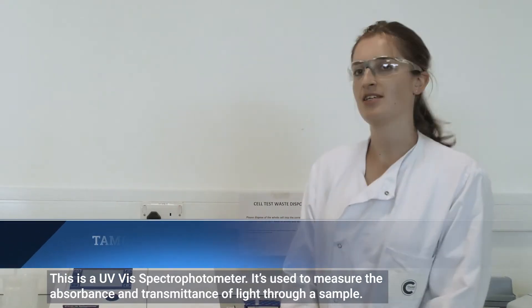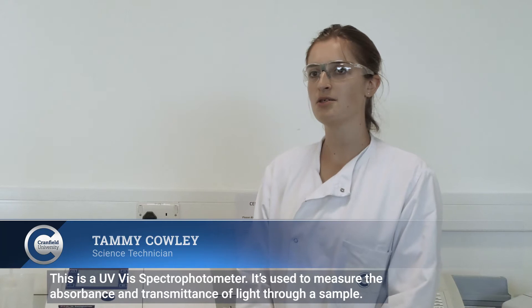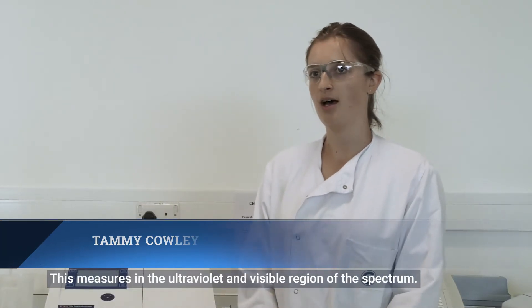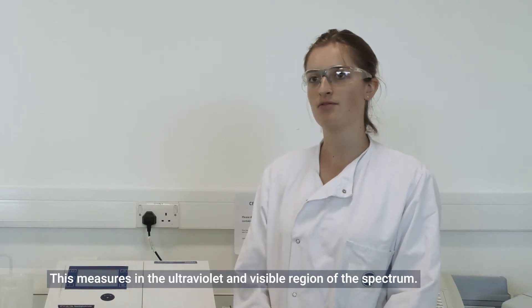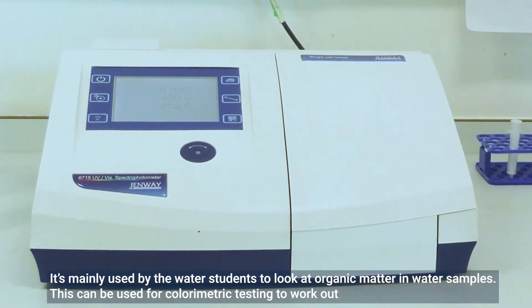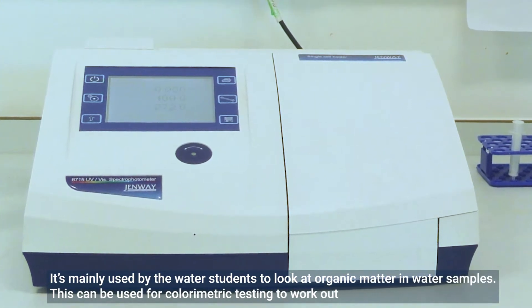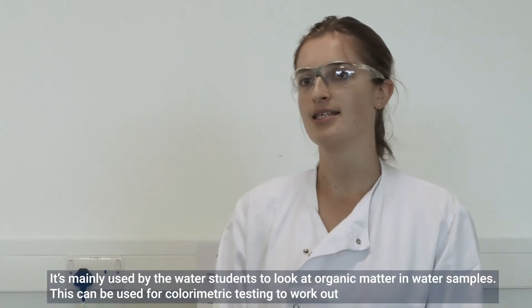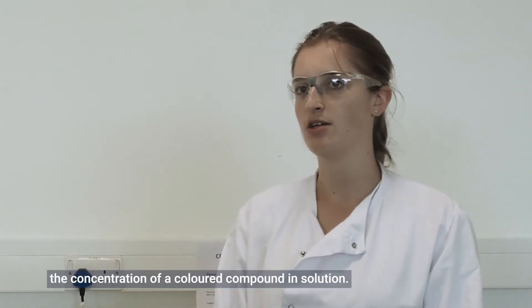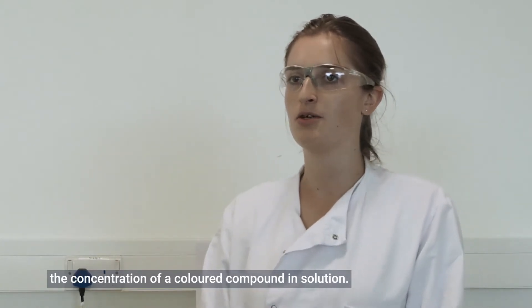This is a UV-Vis spectrophotometer, used to measure the absorbance and transmittance of light through a sample. It measures in the ultraviolet and visible region of the spectrum. This will mainly be used by the water students to look at organic matter in water samples. It can be used for colorimetric testing to work out the concentration of a colored compound in solution.